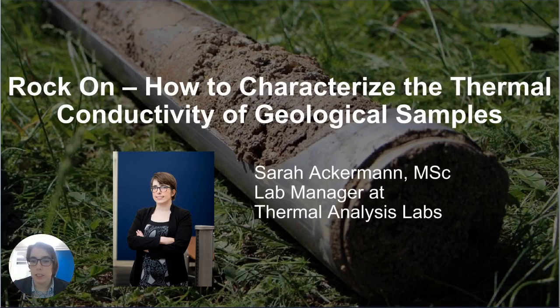talking about the thermal conductivity of geological samples, it encompasses a very wide range of material phases, degree of purity, and other factors. So it's a very complex field, and therefore method selection becomes really important. So that's where anybody who has any interest in geological materials, we would very strongly recommend you to take a look at the method selection guide. Make sure that you're choosing the right material test method for your samples.